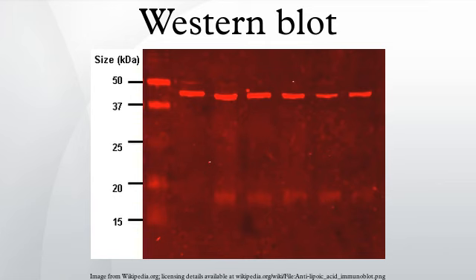Steps: tissue preparation. Samples can be taken from whole tissue or from cell culture. Solid tissues are first broken down mechanically using a blender, using a homogenizer, or by sonication. Cells may also be broken open by one of the above mechanical methods. However, virus or environmental samples can be the source of protein and thus Western blotting is not restricted to cellular studies only. Assorted detergents, salts, and buffers may be employed to encourage lysis of cells and to solubilize proteins.